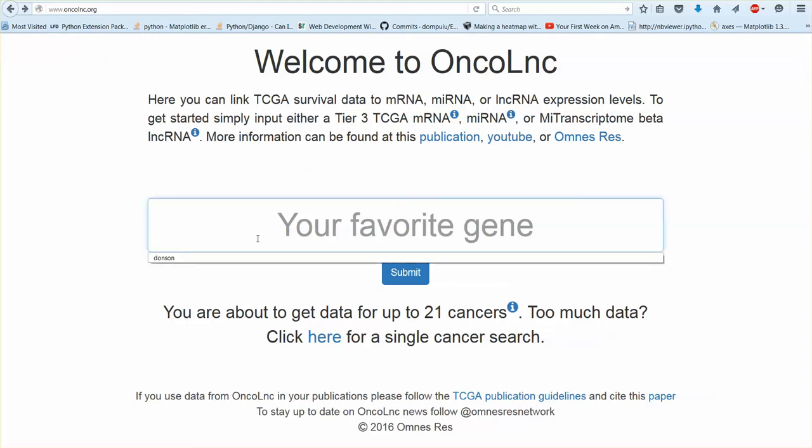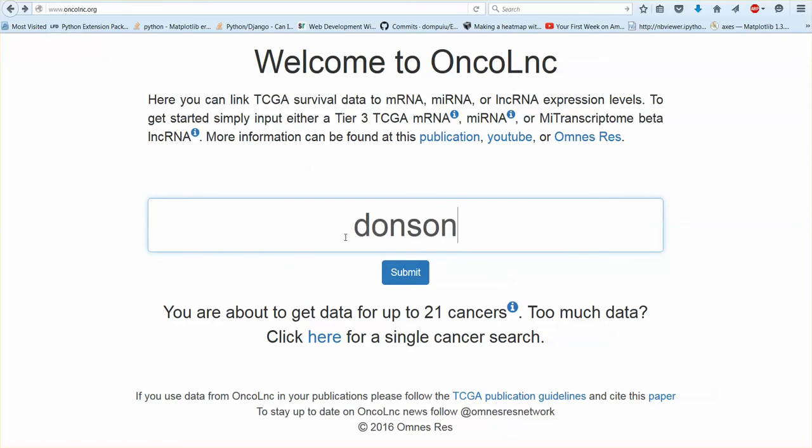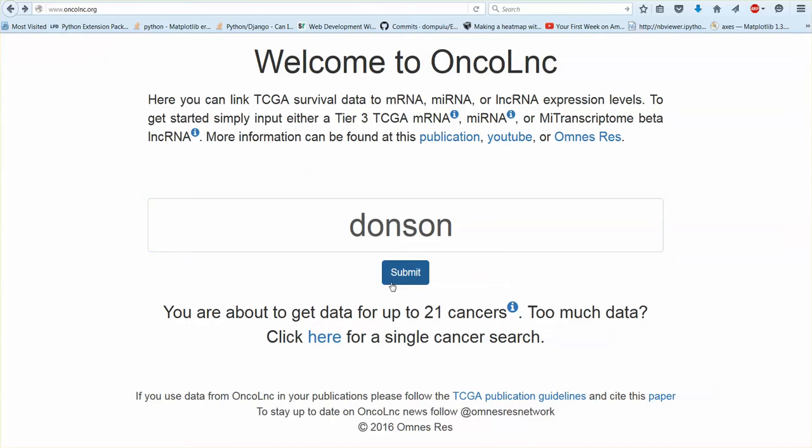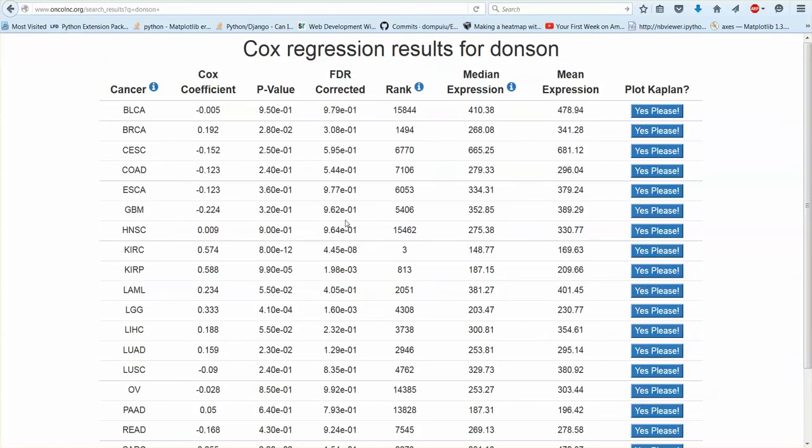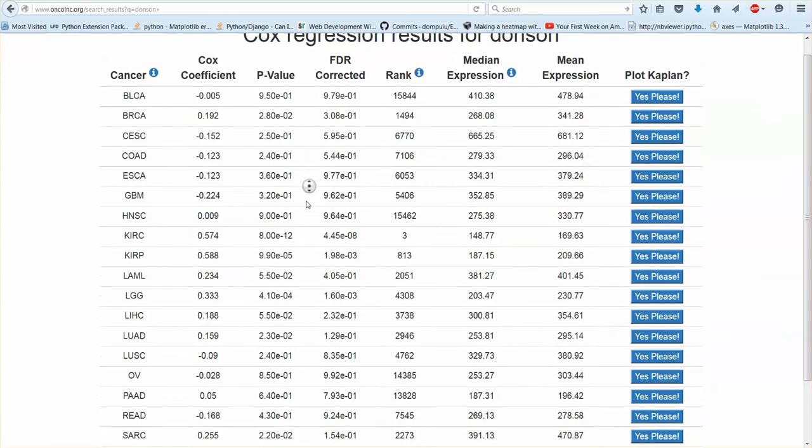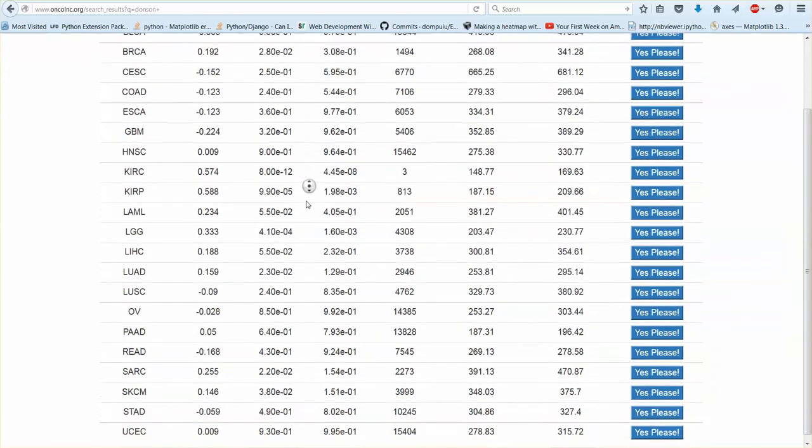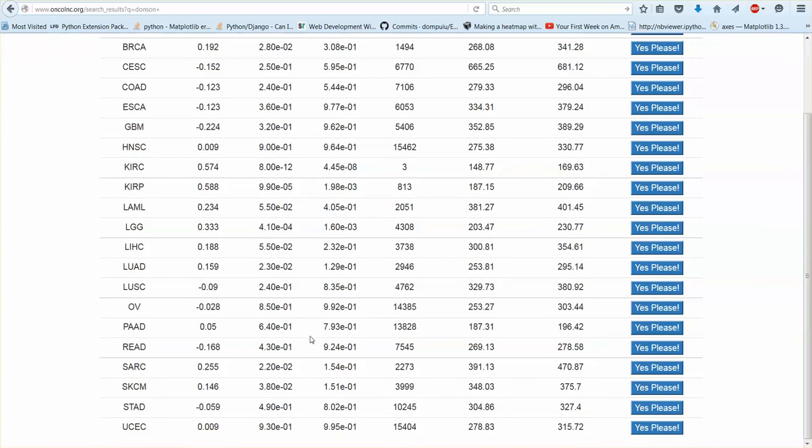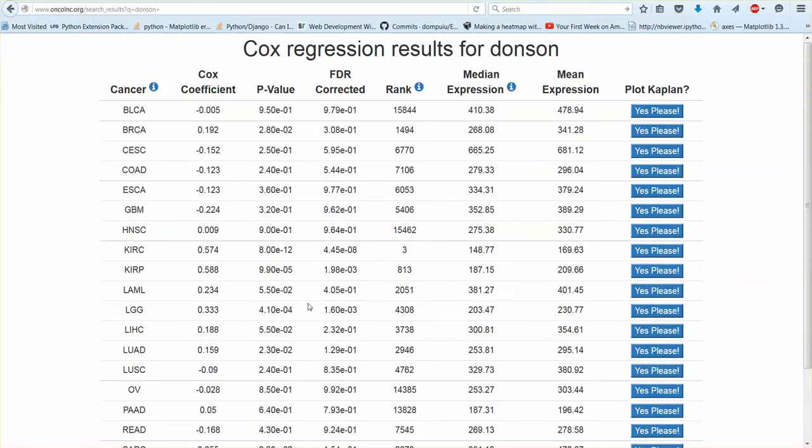To get started all you have to do is type in your gene here. Here's an example of a gene I typed in. Uppercase, lowercase does not matter. Spaces don't matter. You can submit that and you'll get results for up to 21 different Cox regression analyses. These are pre-computed.